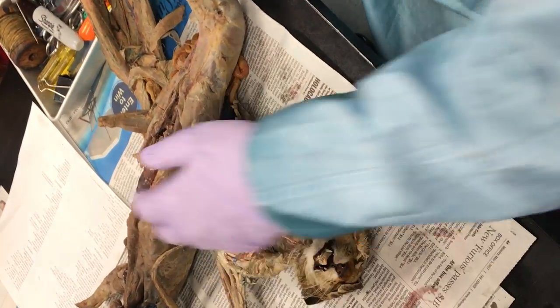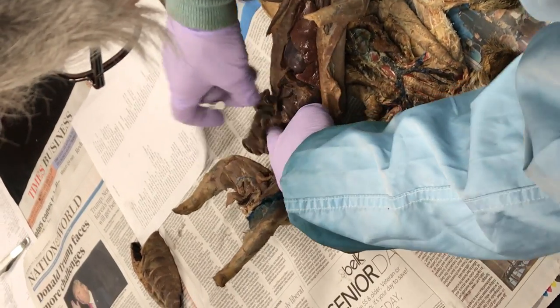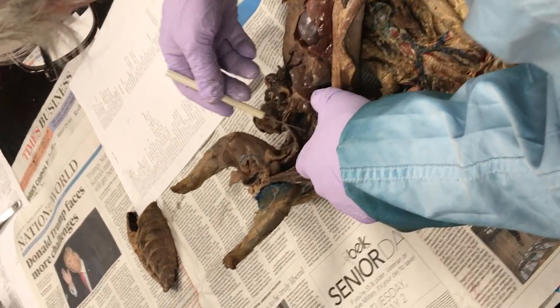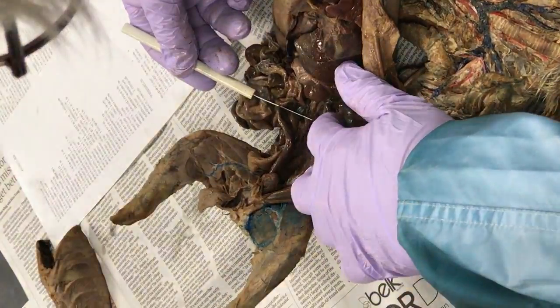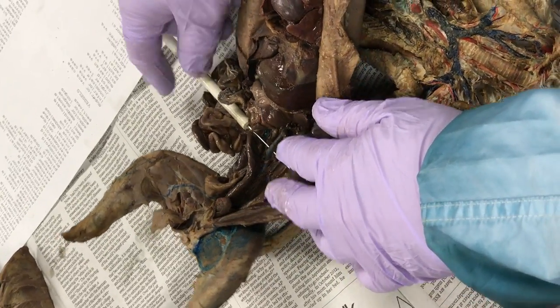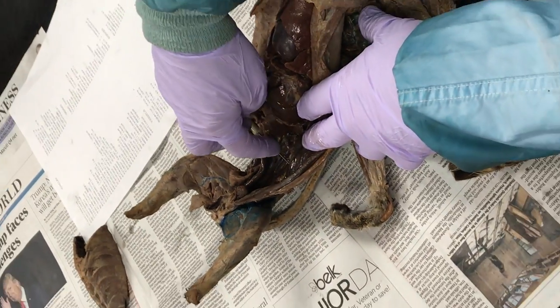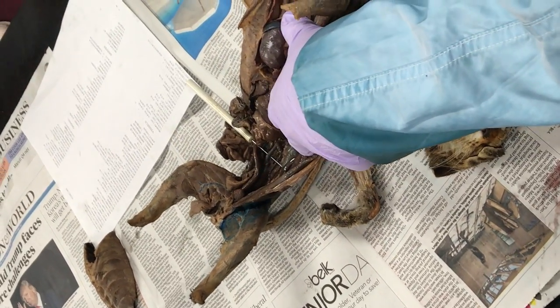Inferior vena cava — another easy one. All your minks are good for inferior vena cava, even this greasy one. Look at that thing. Inferior vena cava — the big blue. Got it? Everybody got that? That's too correct — you're going to get that on your paper. Nobody's going to miss that.